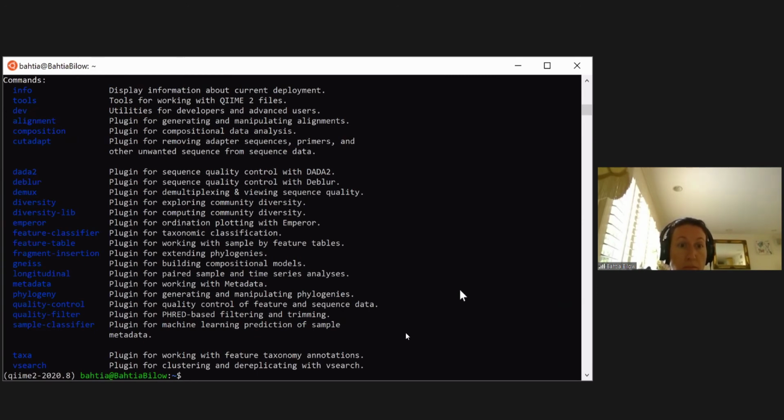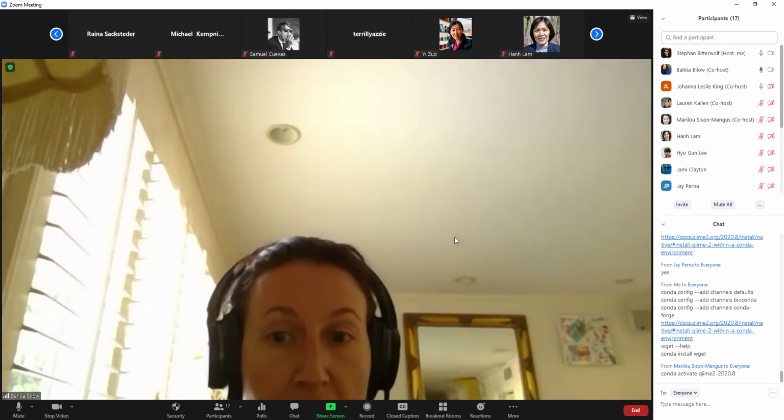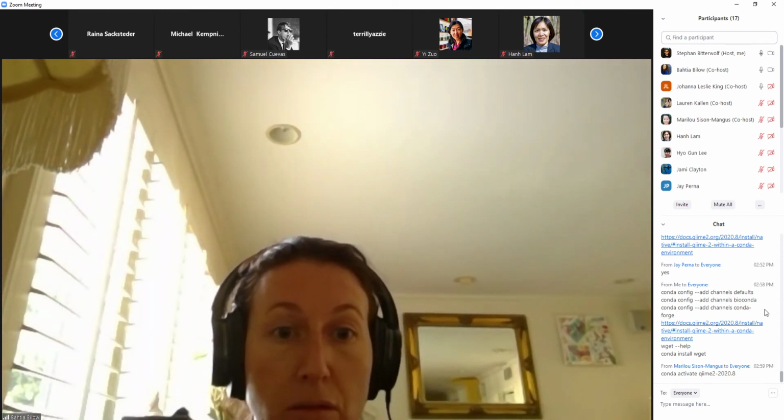So you could scroll up on that if you wanted to read anything about it. So you look like you've got QIIME installed and you are good. Okay, great. Then I just need to run those other commands. Yeah. So now you'd type conda deactivate, and you could do the conda config ones.